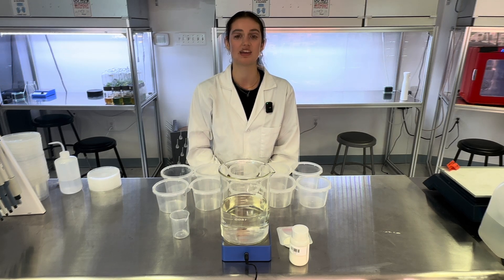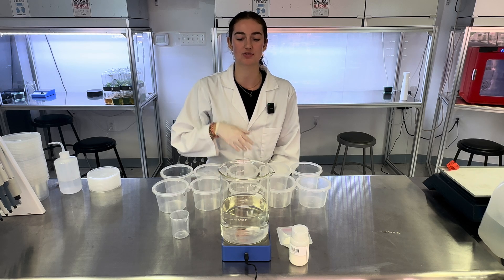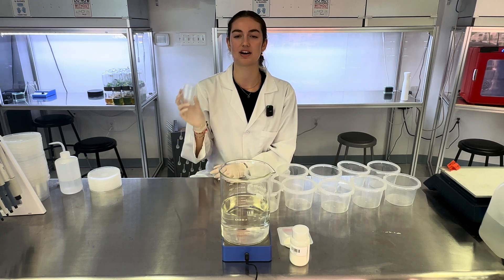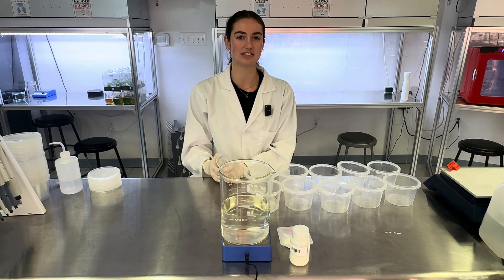Now that the media is finished, I'll show you two different methods of sterilizing the media. If you don't have a laminar flow hood, you must directly pour your media into your tissue culture containers prior to sterilization. To do this, I will add 100 milliliters of my media into each container.